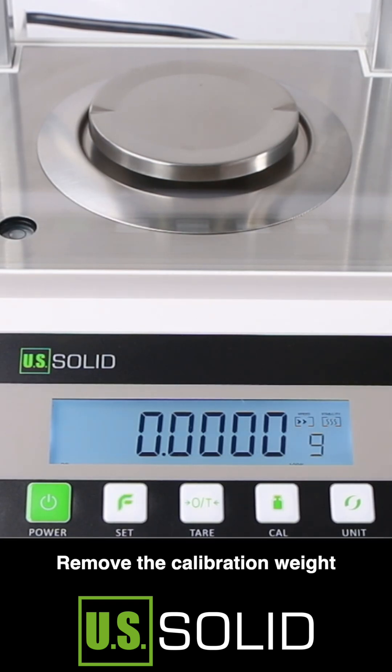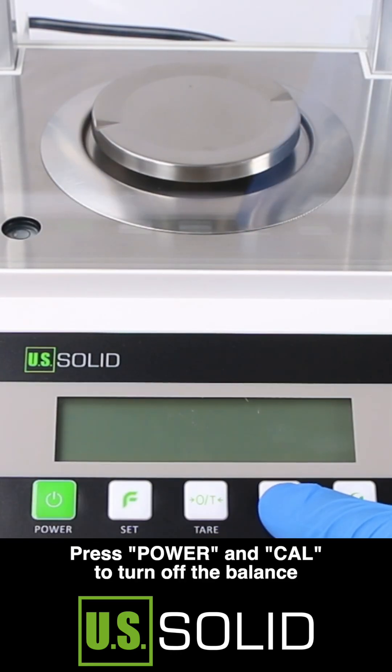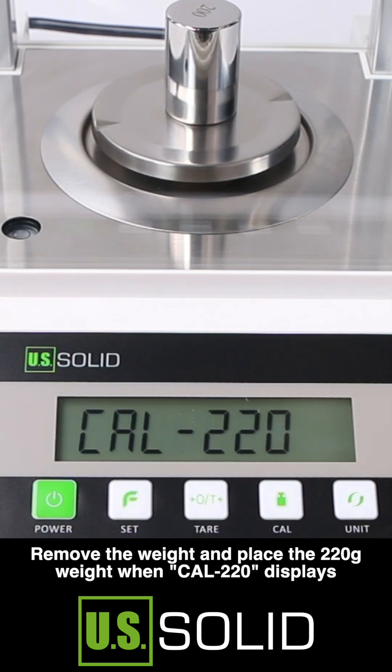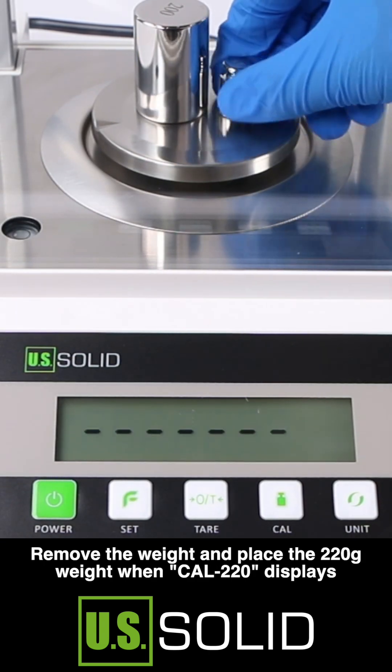Remove the calibration weight. Press power and calibration to turn off the balance. Place the 200 gram weight on the pan, then remove it and place the 220 gram weight.